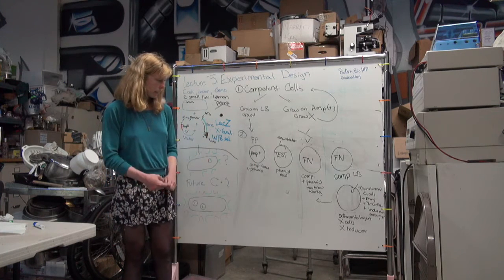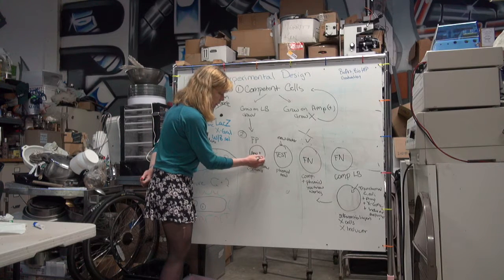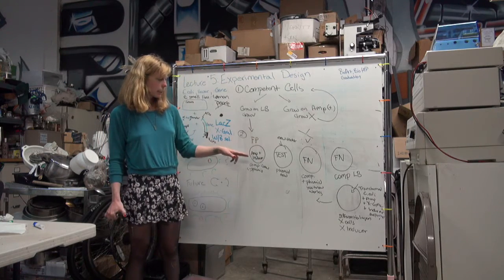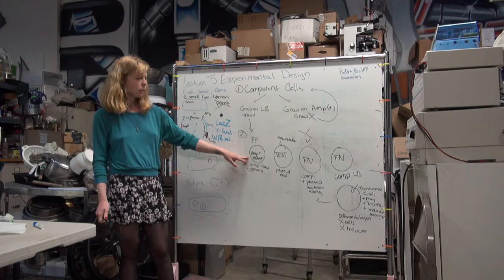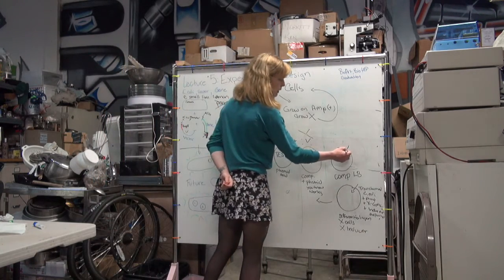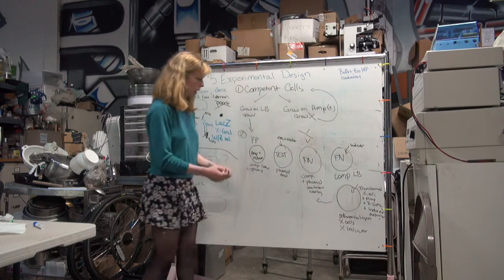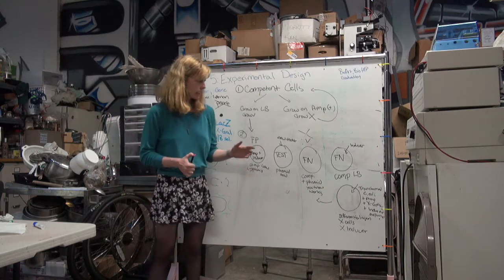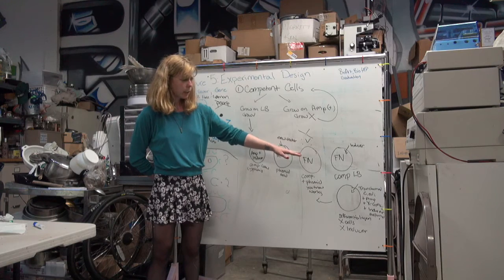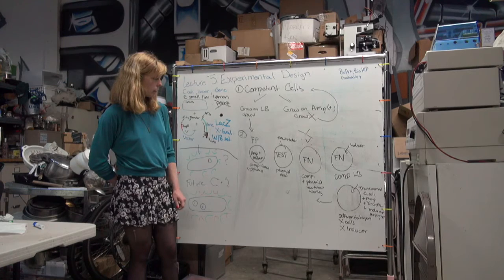You can do ampicillin here and also your inducer. And if there's a substrate, which this one happens to have as well, because you want these cells here to not grow and also not be blue. You can also put the inducer on this plate as well, if there happens to be one. You want to make sure it's not toxic to the cells. You also want to make sure that it doesn't cause your non-transformed cells to turn blue, which can totally happen, in theory.